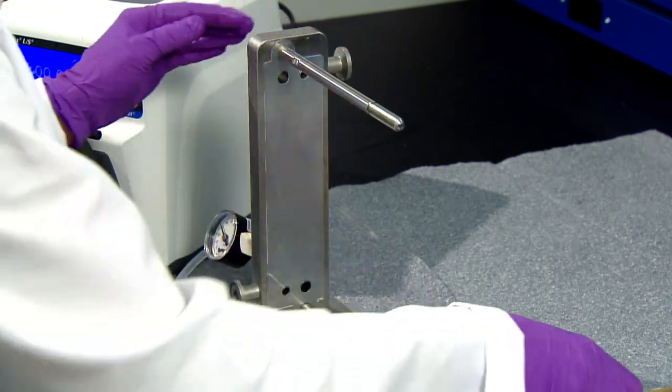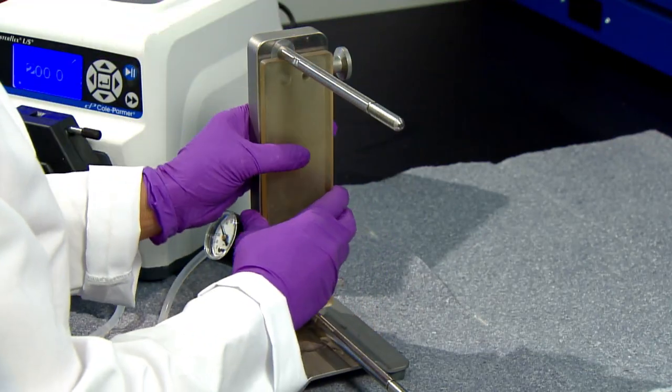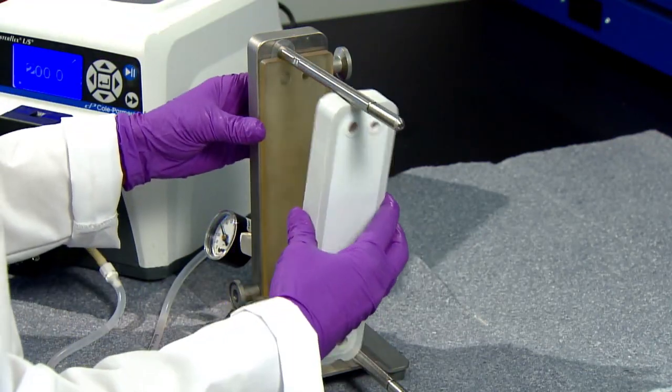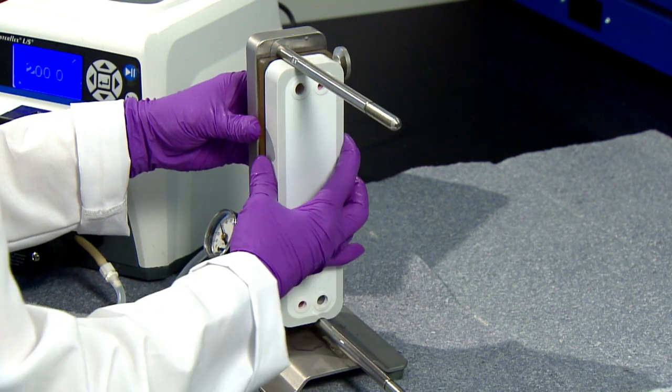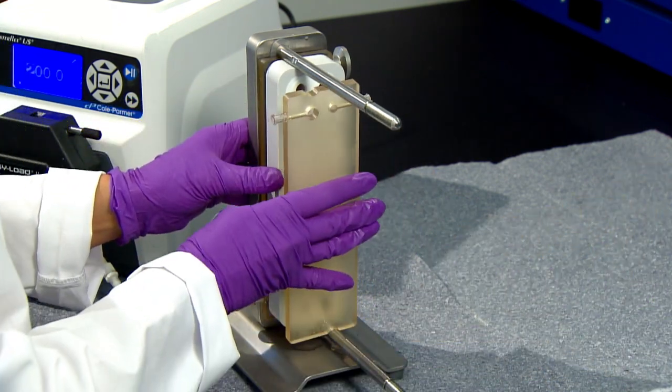The first diverter plate comes next, with feed port aligned with that of your holder. It is important to alternate cassettes and diverter plates, making sure to flip the orientation of the feed ports on consecutive diverter plates.